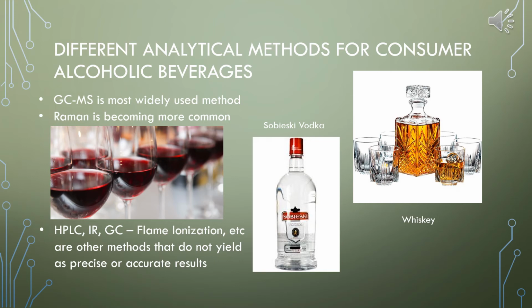Raman spectroscopy, as a method of quantization of ethanol concentration, is a useful tool employed by scientists due to easy sample preparation and really fast measurements, which allow for more accurate average data with better signal-to-noise ratio. This allows Raman data to be more easily reproduced, as well as have greater precision and accuracy. The issues with Raman are that the instrument and system setup costs a lot of money, and the spectra is easily drowned out by fluorescence, which makes complicated samples hard to measure accurate data.